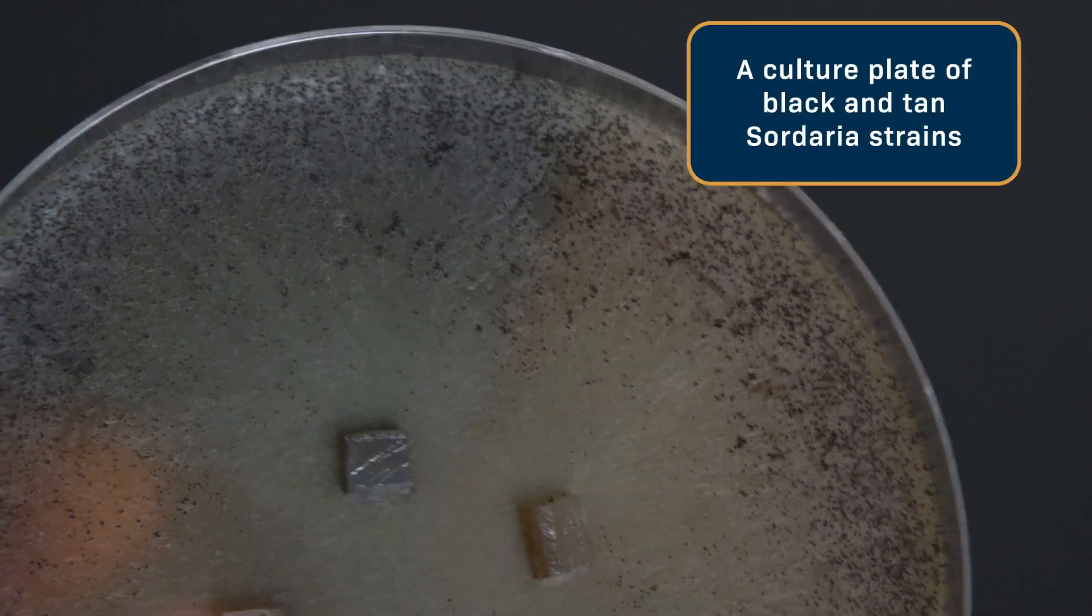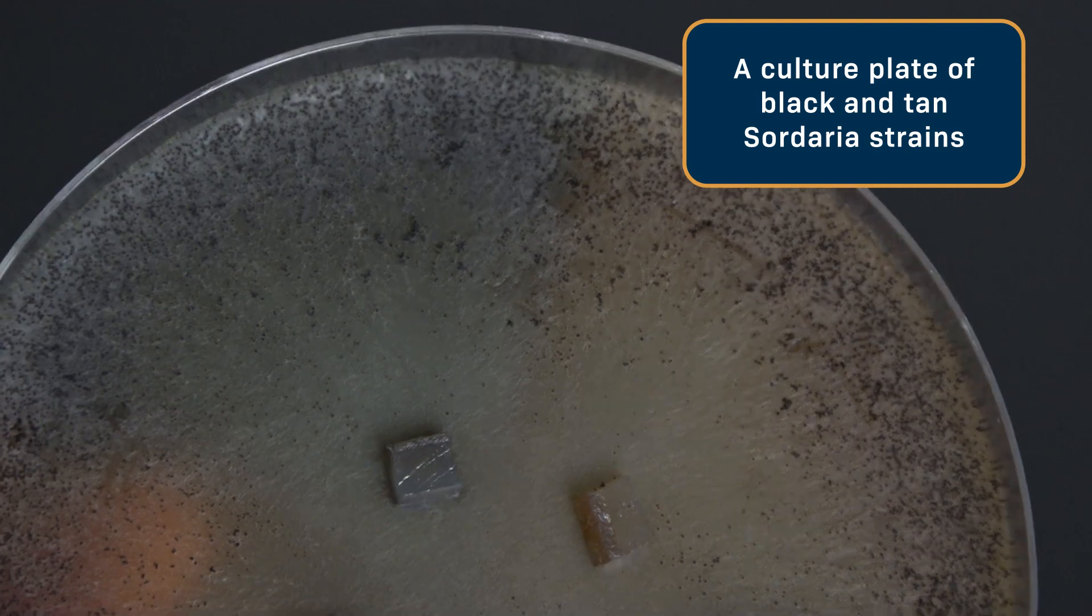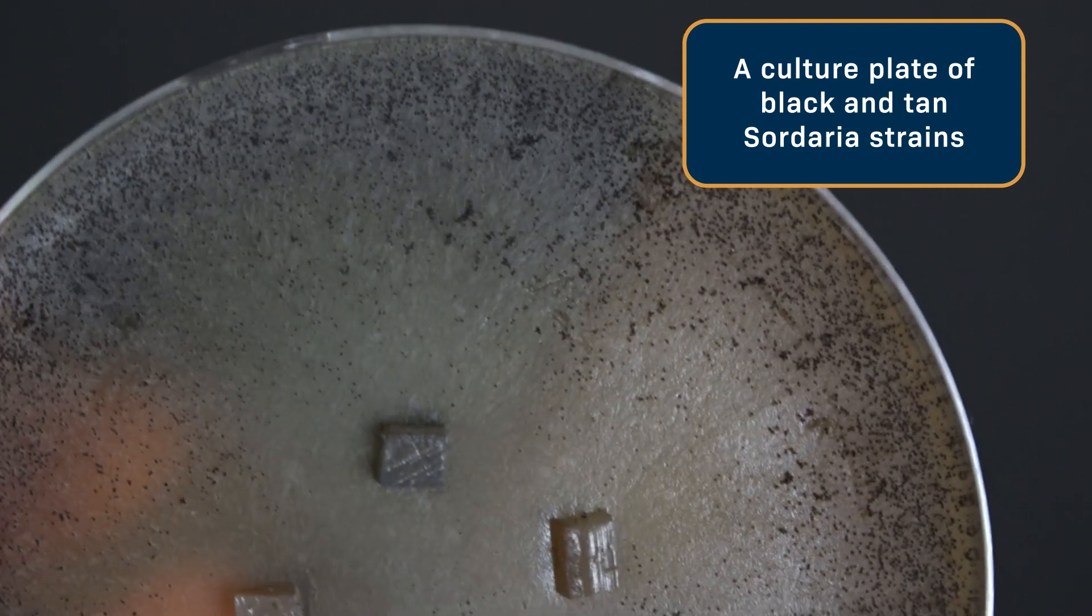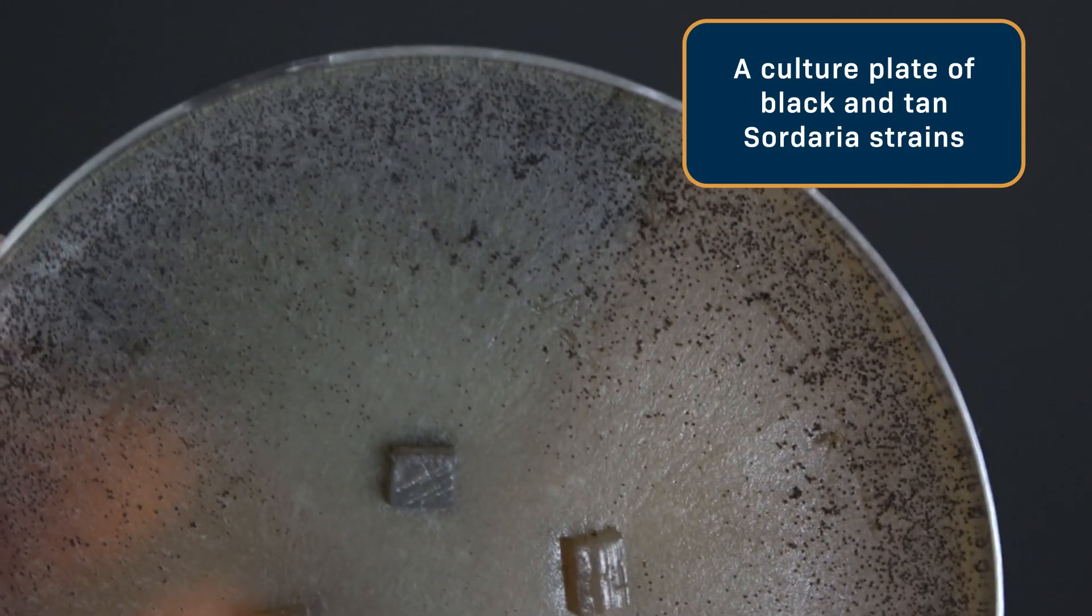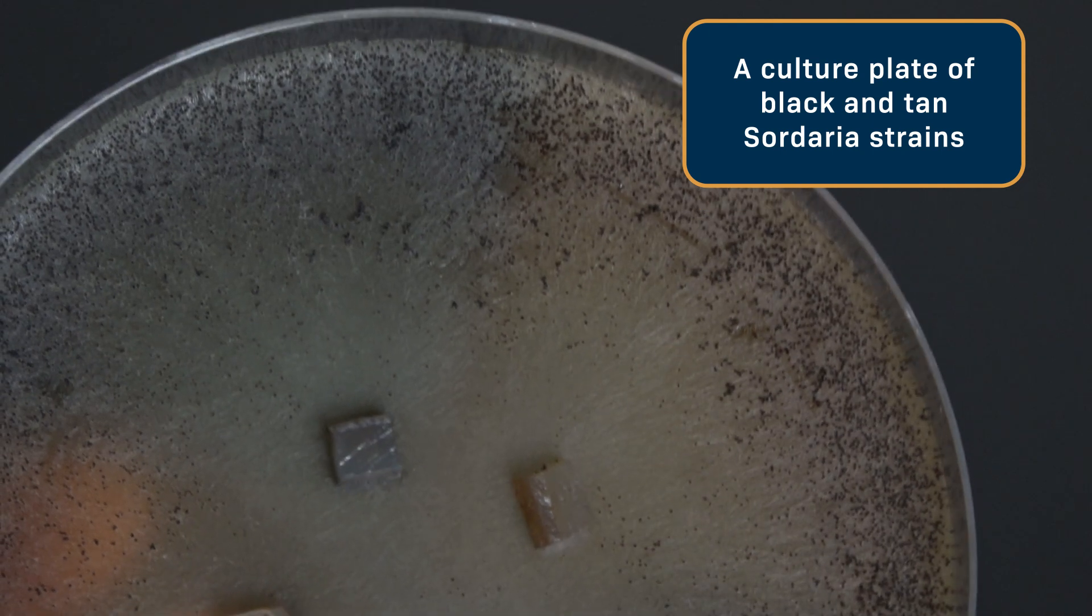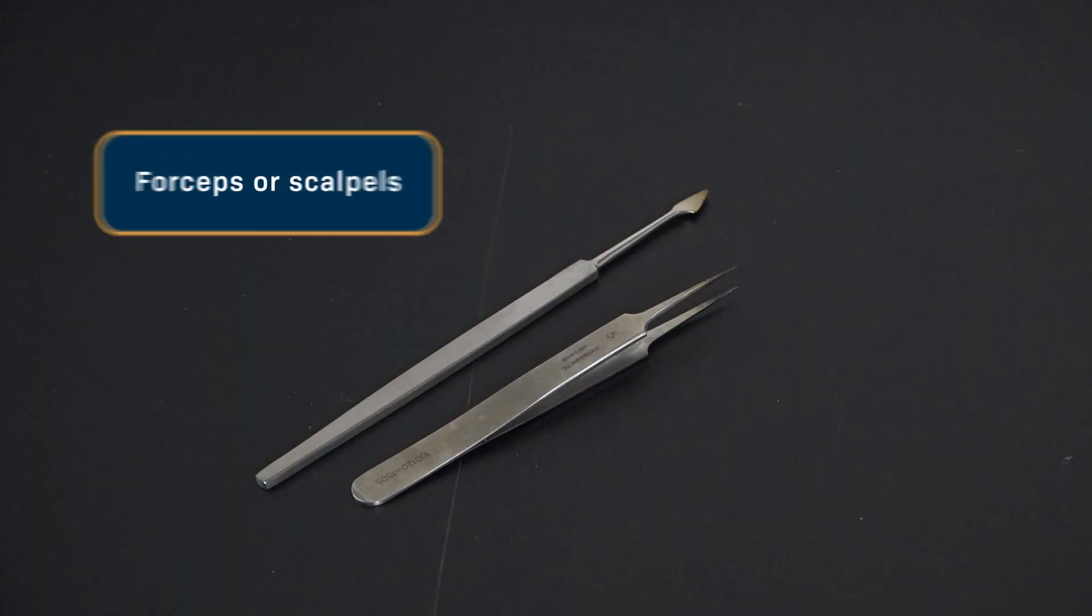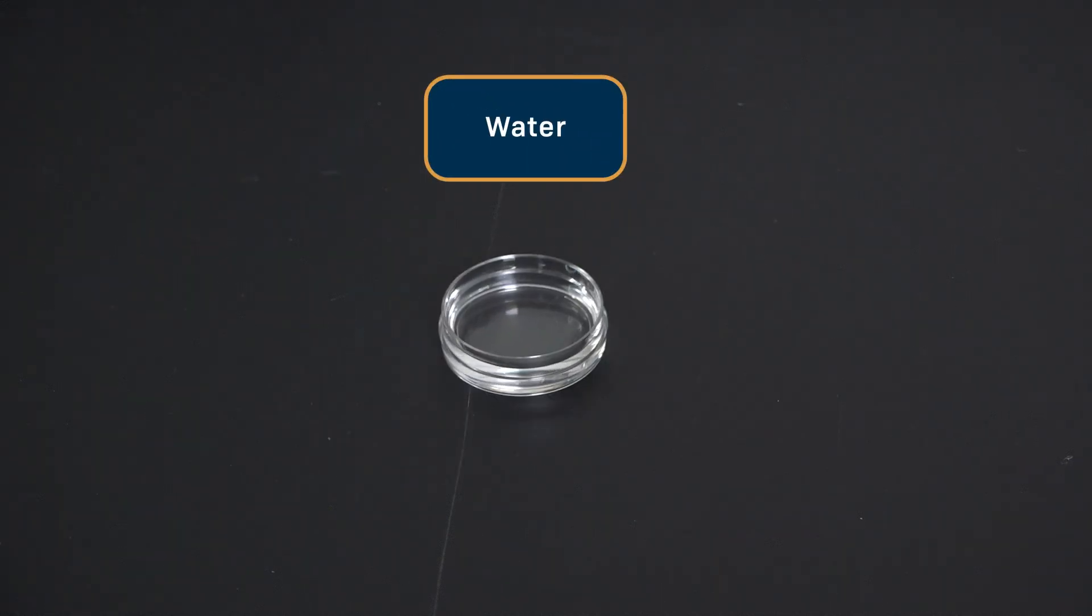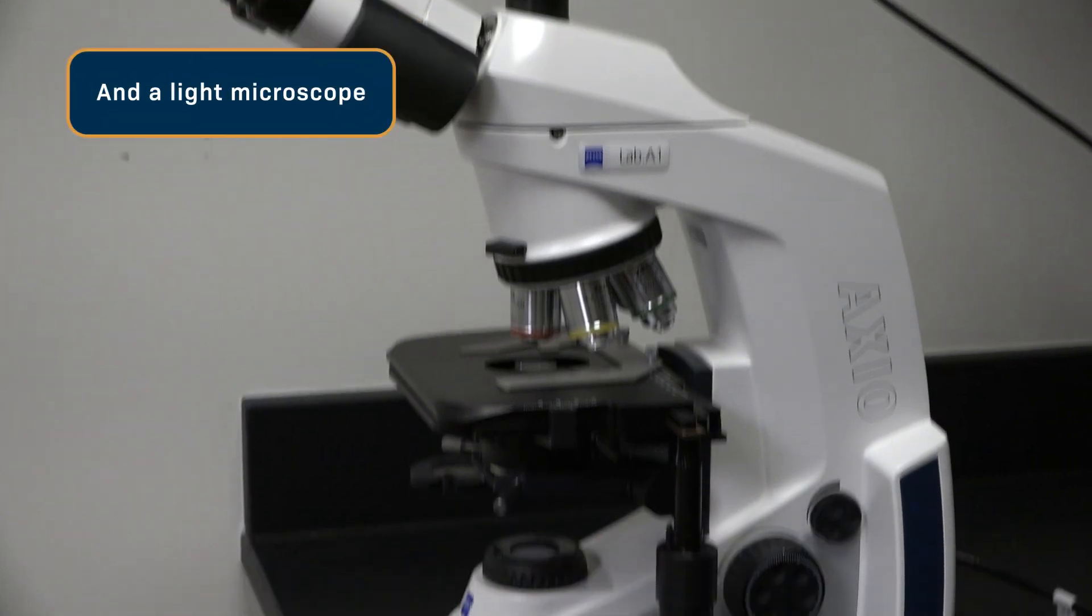We'll need a culture plate of black and tan Sordaria strains that are getting frisky. You can buy these from biological supply companies, so don't worry about making the plates yourself. Please note that hand washing is an essential component of both sterile technique and laboratory safety. I washed my hands before handling the Sordaria plate to prevent contamination of the sample. Forceps or scalpels, a transfer pipette, water, microscope slides and cover slips, a pencil, and a light microscope.